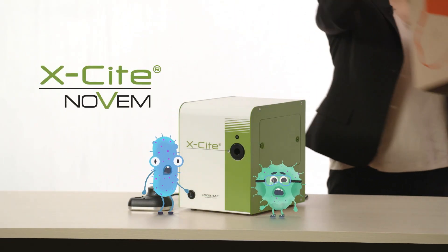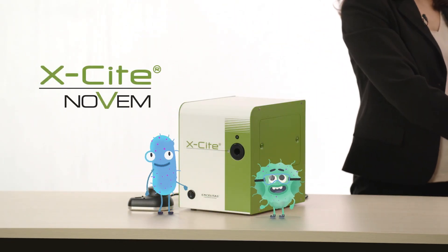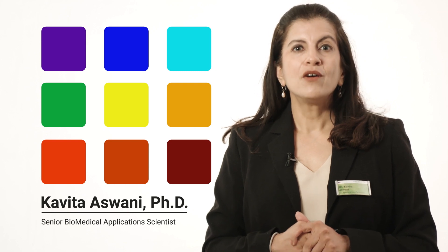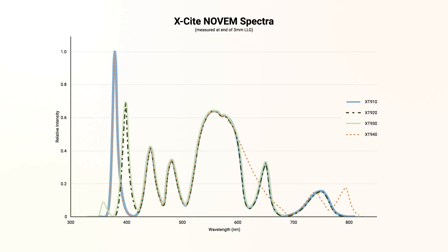This, my friends, is the new Xcite Novum. It is the brightest and most advanced LED illuminator from Xcite. The Xcite Novum can generate nine wavelengths, which you can control individually from 340 to 785 nanometers, allowing you to image from FURA 2 all the way to IR 800.